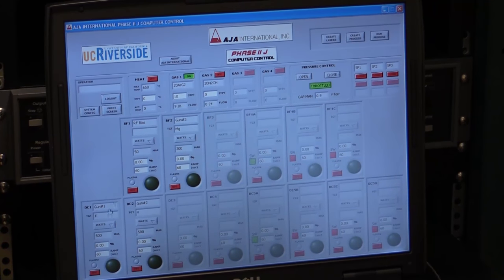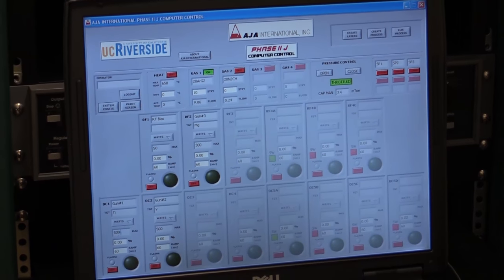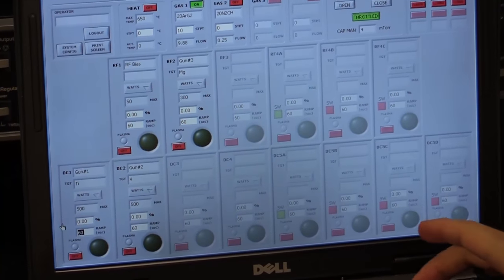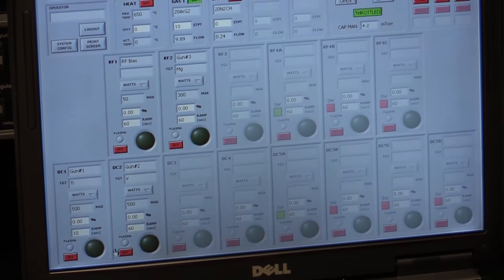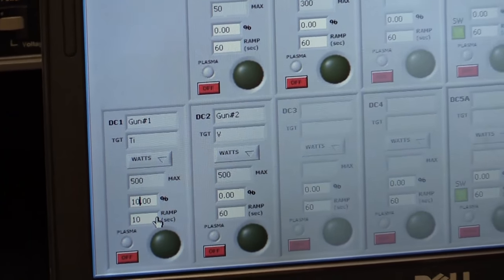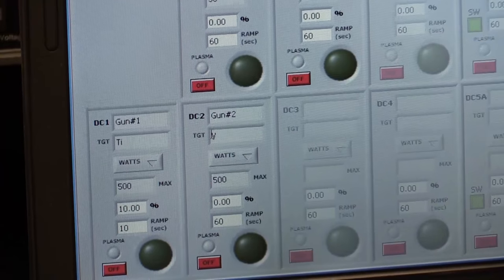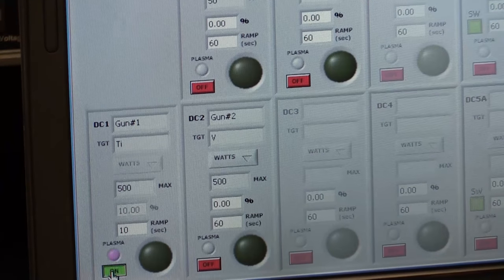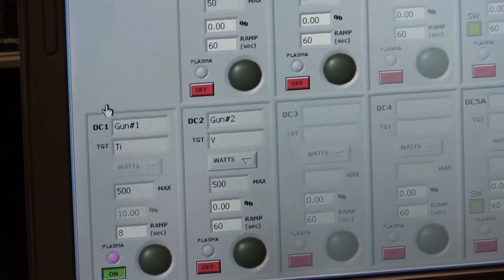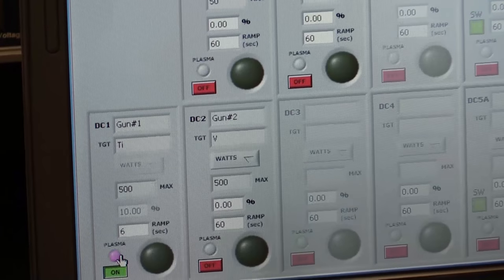I'll strike a plasma in DC1, direct current 1. I'm going to use a 10 second ramp time to get up to 10% power, which is 10% of 500 watts, so 50 watts. We see this purple light comes on, which indicates that we have a plasma.